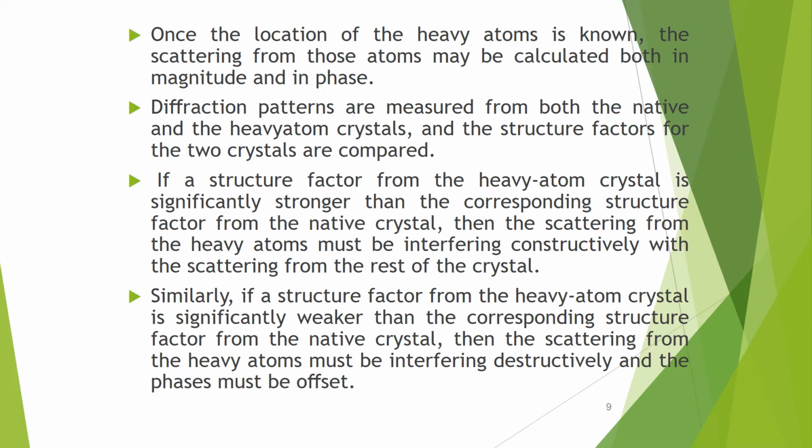The diffraction patterns are measured from both the native and the heavy atom crystals, and the structure factors for the two crystals are compared.